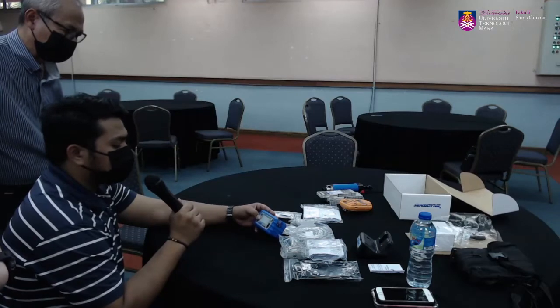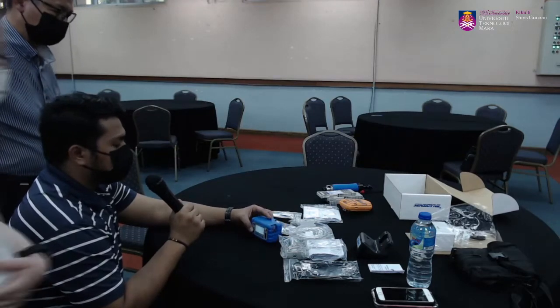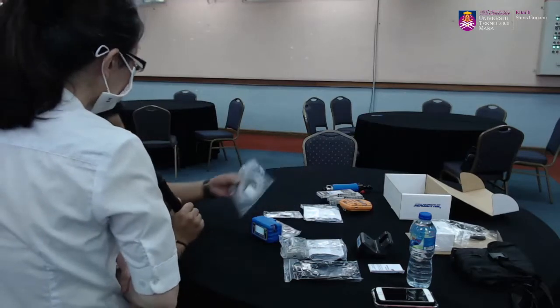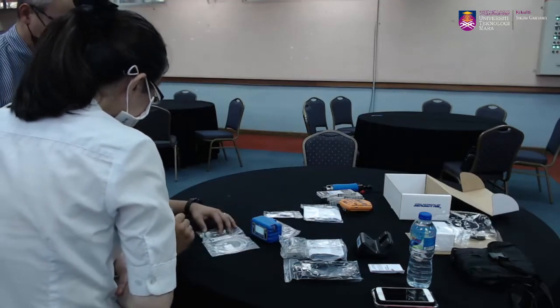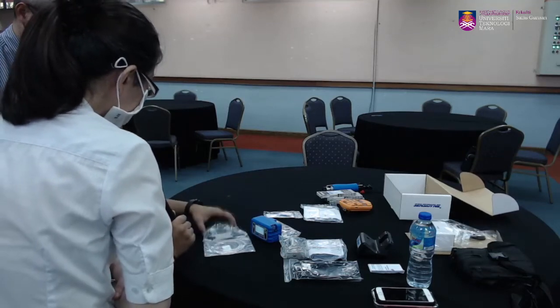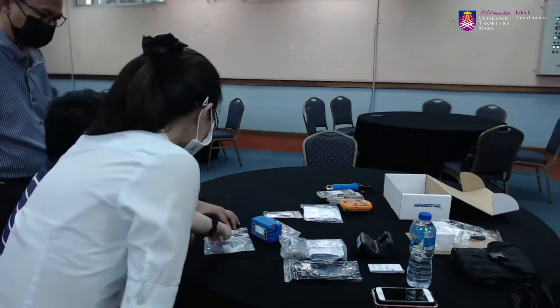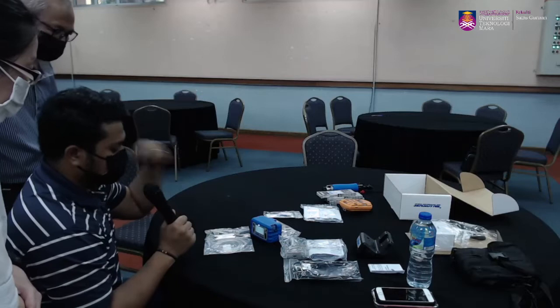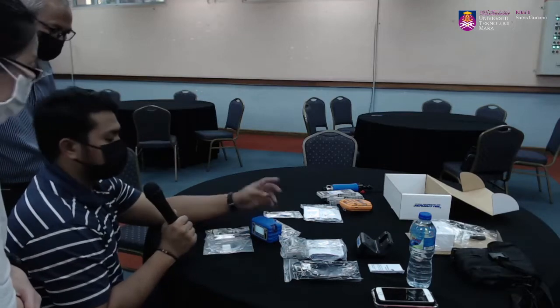Because what media is usually used? The media is connected with this tubing and also connectors. For example, if we want to use charcoal tubes, then we have to use this one. We break the charcoal tube and put it in here, then we tighten it and just clip on the Tygon tubing. So that is the way.